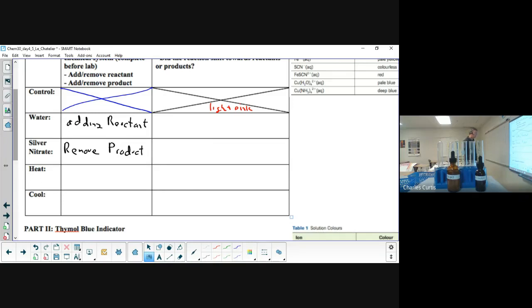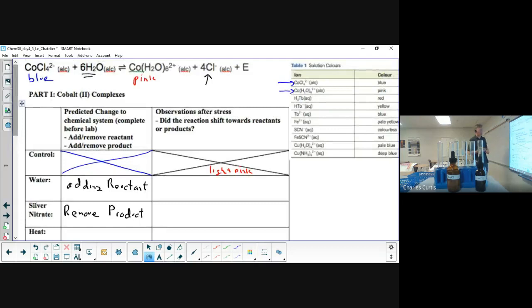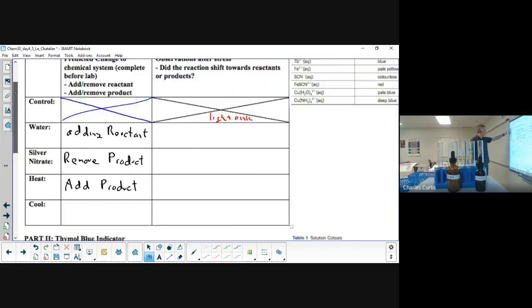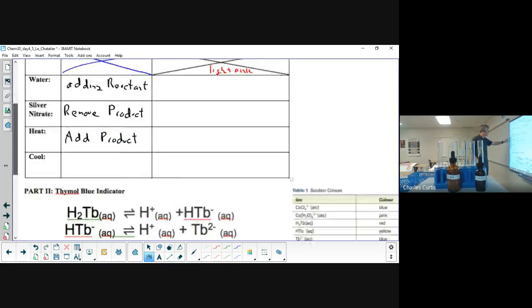Okay. Next, we're going to heat up our equilibrium mixture. So I have some hot water that I've boiled, and then I have an ice bath that we can put it in. In terms of heating it, heating is going to add energy. Well, we see an energy term. So heating it is the same as adding a product, because energy is a product or something produced from this reaction. So heating is going to be add product. Again, we're thinking of that energy term as another chemical species. Cooling it is going to do the opposite. It's going to suck energy out of our equilibrium mixture. Because that E is a product, we're going to be removing some of that product.